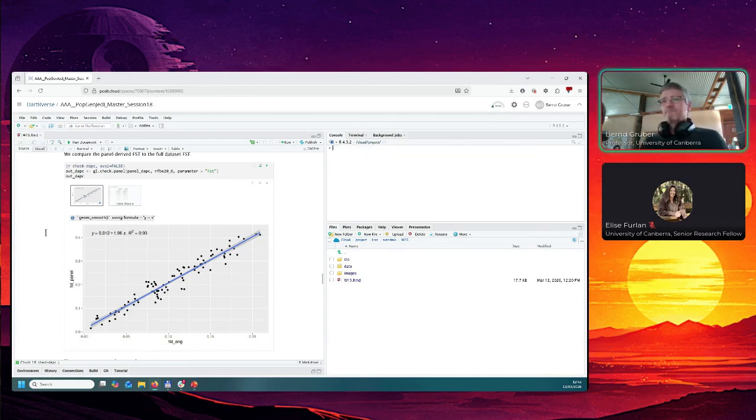Hope that makes sense. This also addresses one of the questions that came up about the difference between populations. At the high end, the two populations that were most differentiated are still most differentiated with the new panel, and similar as you go down the line. So that variation is maintained. Obviously some pairs won't be maintained. It's not perfect, it's a subset. If I had used all 6,000 SNPs, that would be a one-to-one relationship.